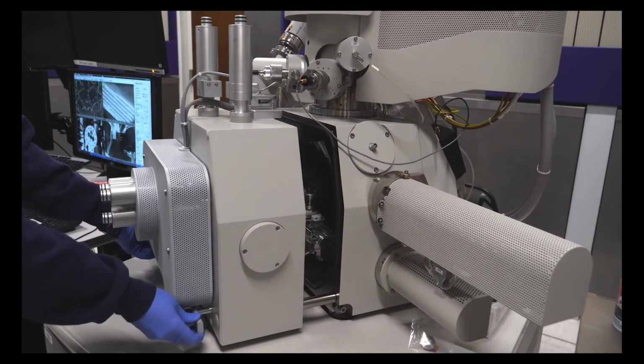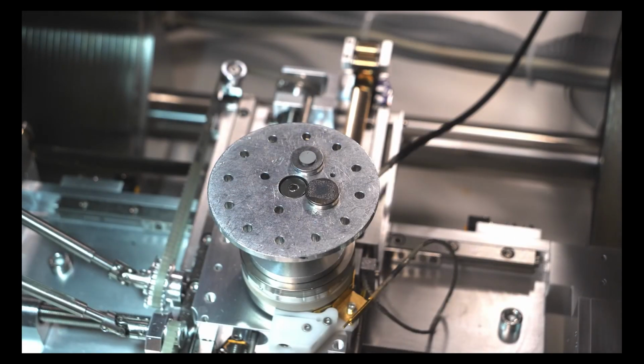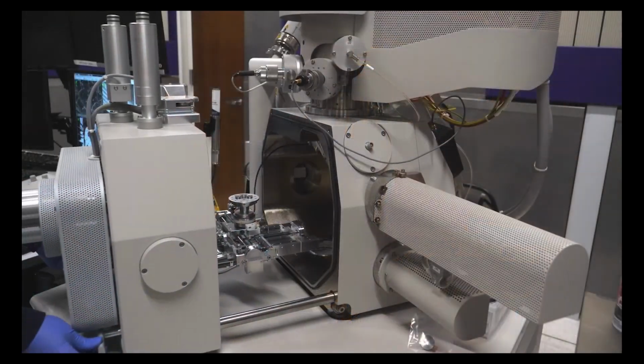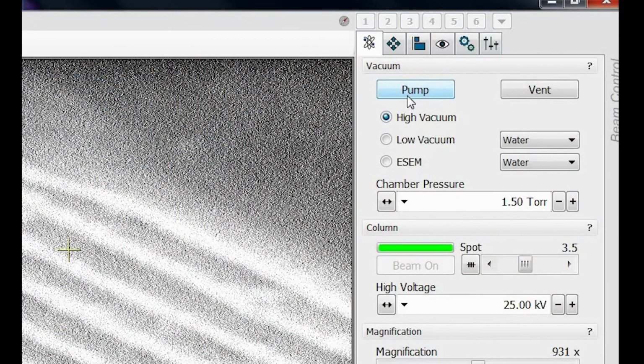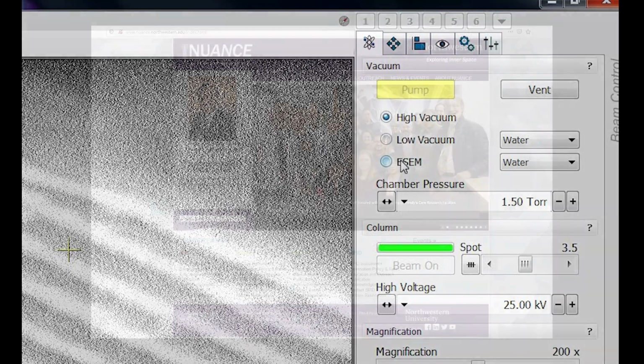Once the chamber has vented, you can open the door using the handle and remove your samples. It is important that you always pump down the chamber before you leave. Once you have pumped down the chamber, you can end your reservation in the new course system.